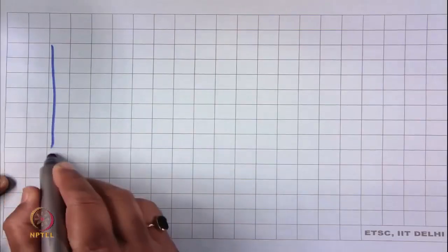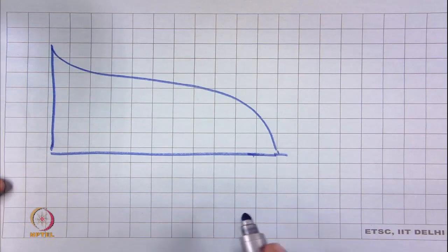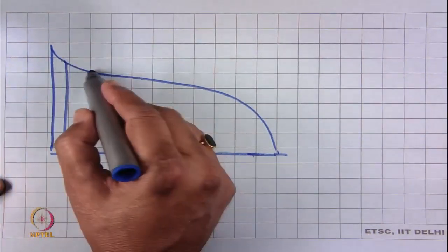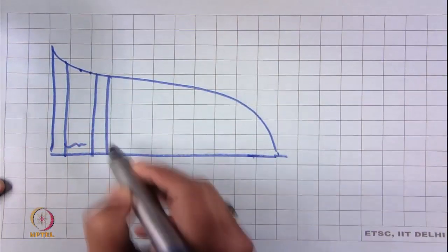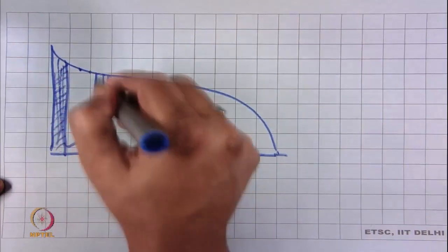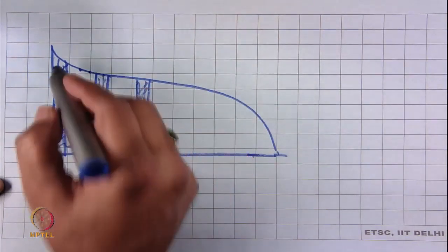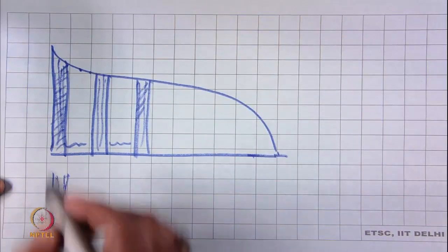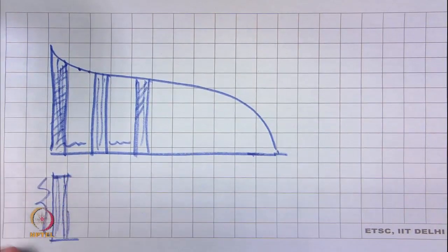Now, let us see. This is the comb sorter diagram. From here, we are taking out the fibers. We take a few fibers, and after a 1 centimeter distance, we take another set of fibers. When we have taken this segment of fibers, we slice the edge to make it uniform. So, this is the actual fiber.